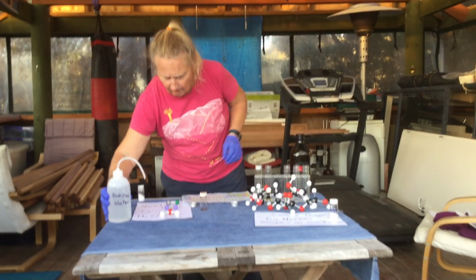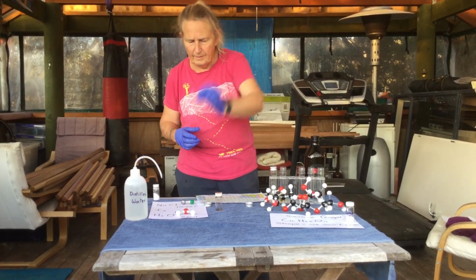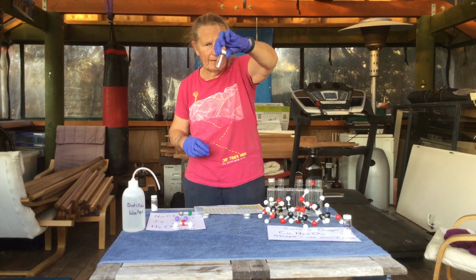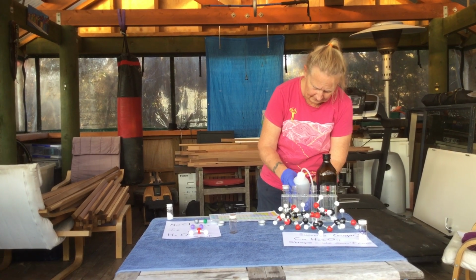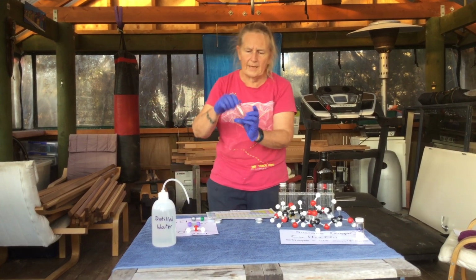Okay, iodine, this is I2, remember? That's the natural state that it's found in. You've seen this before, we did this when we did the sublimation. I'm going to drop this into some distilled water. And I'm taking bets.